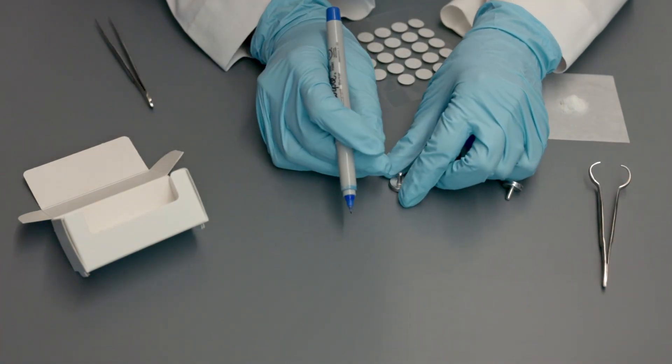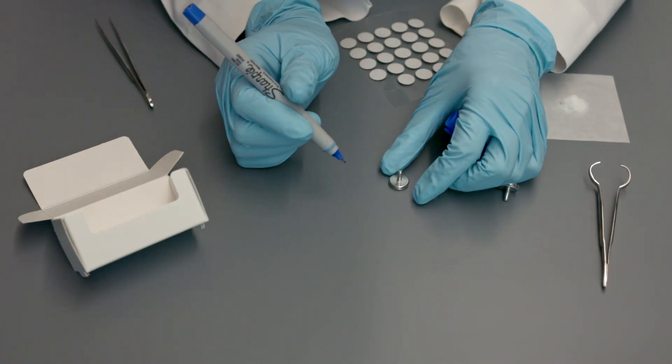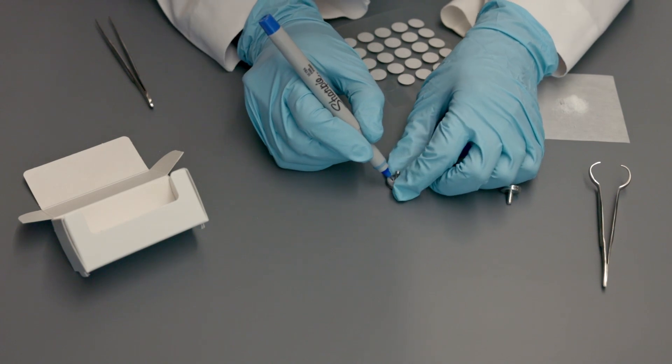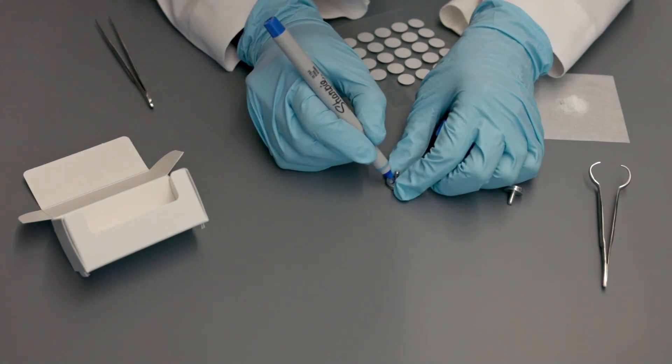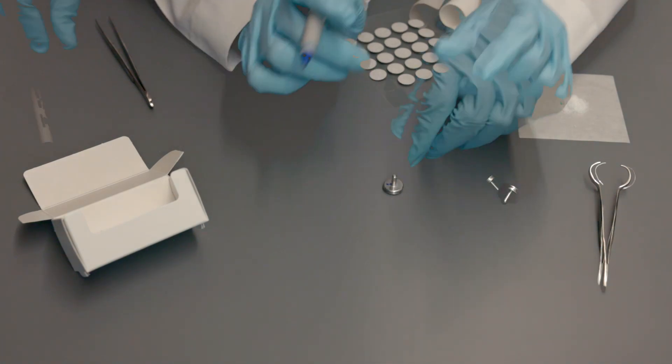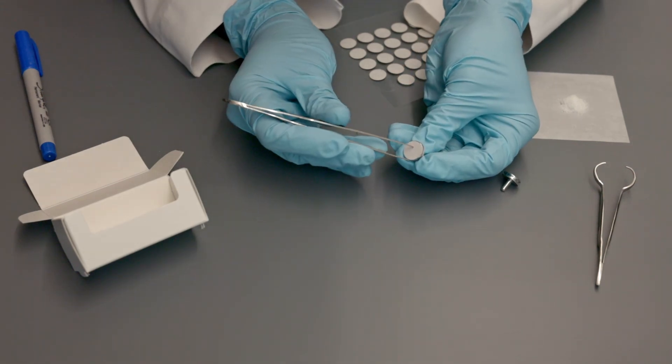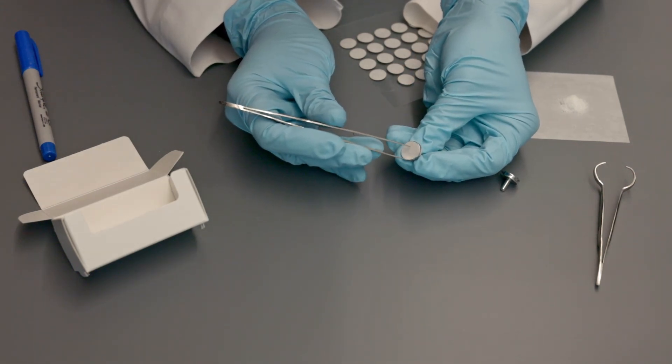Label the mount with the sample name on the bottom of the mount. Carefully remove the top liner to expose the conductive carbon tape.